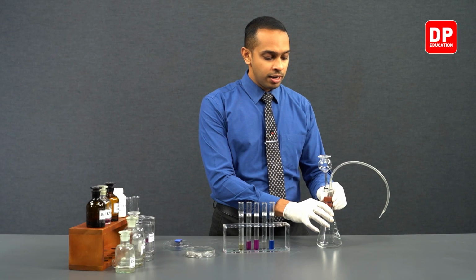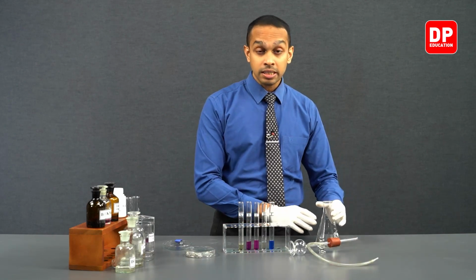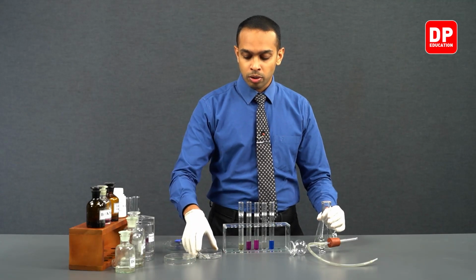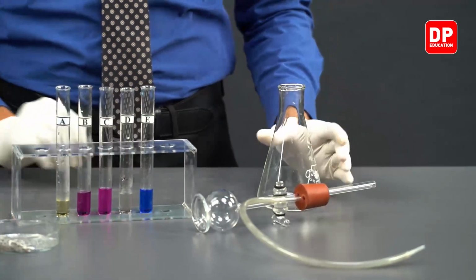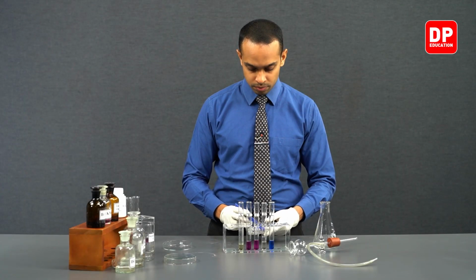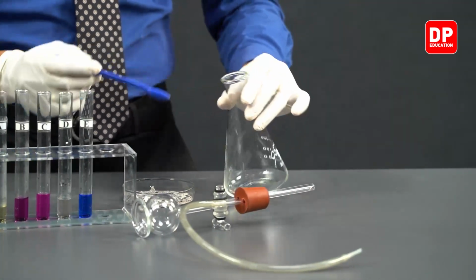So we have our conical flask here. We will remove the stopper from the conical flask, and we can add a small amount of calcium carbide into the container here. So let's take some calcium carbide and let's add a small amount of calcium carbide into the conical flask.